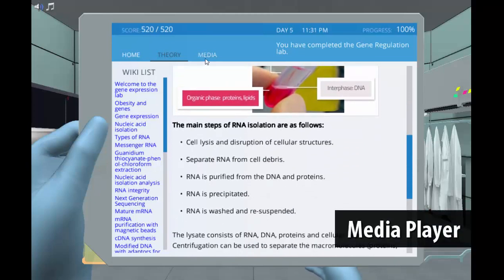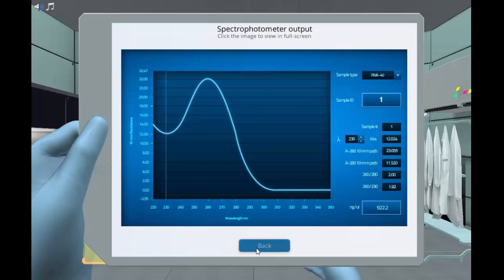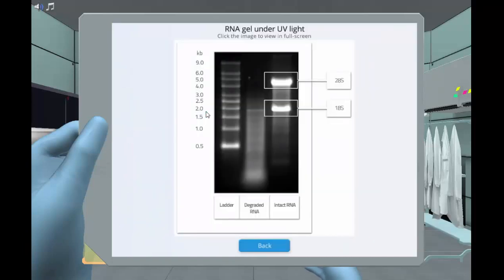Also with the media player function, students will be able to see the animations, graphs, and collected data several times during the lab, as well as at a later time for exam preparation.